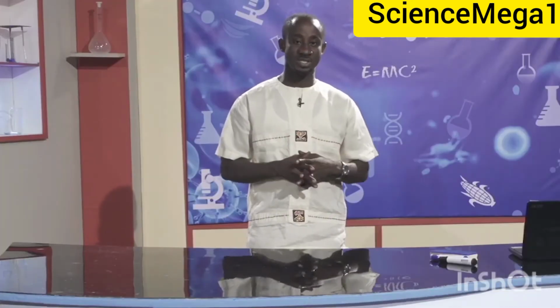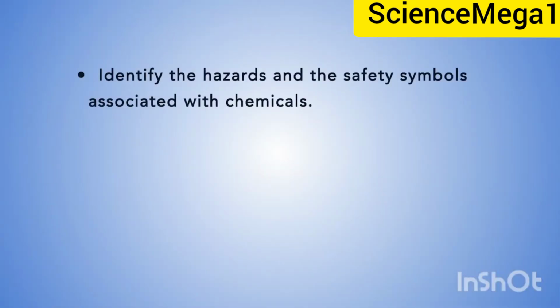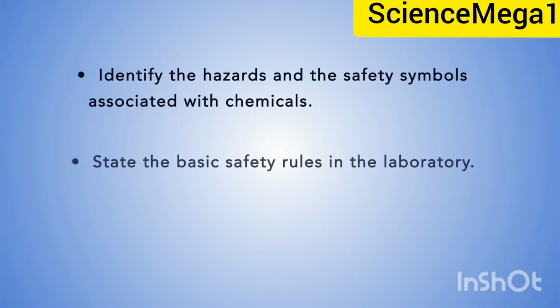At the end of this lesson, you will be able to: 1. Identify the hazards and the safety symbols associated with the chemicals. 2. State the basic safety rules in the laboratory. Now let's focus on safety precautions in the science laboratory.